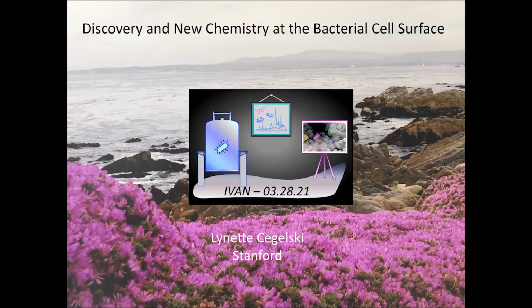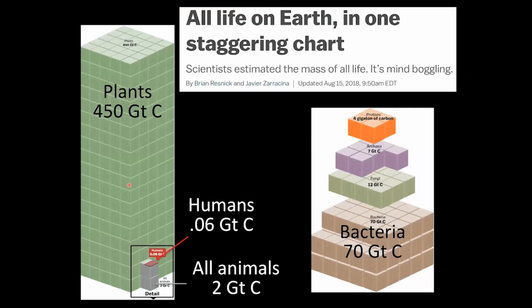And I'll talk in particular about some bacterial work and how solids NMR is uniquely enabling and addressing some of the challenges posed by understanding bacteria that you can't do with solution NMR or crystallography. So really, solids NMR being uniquely enabling.